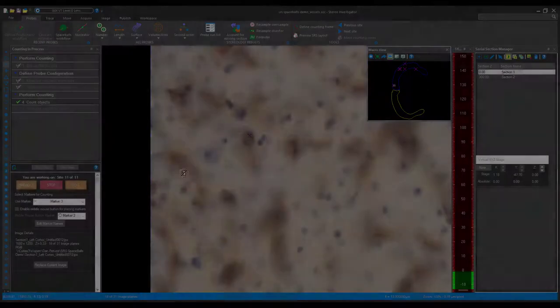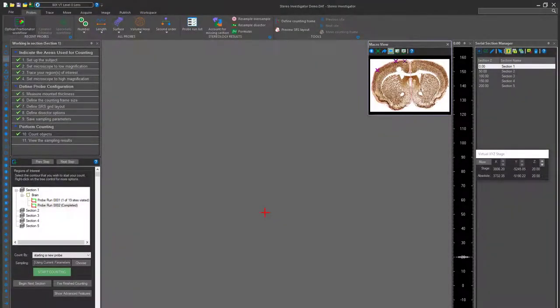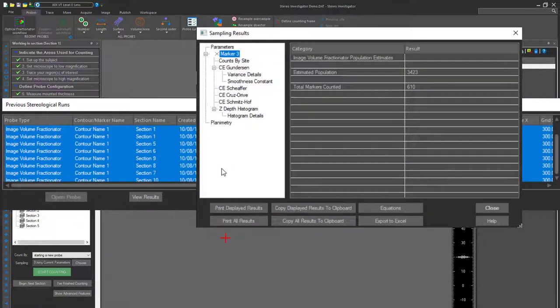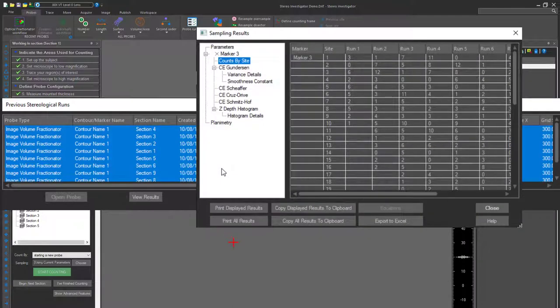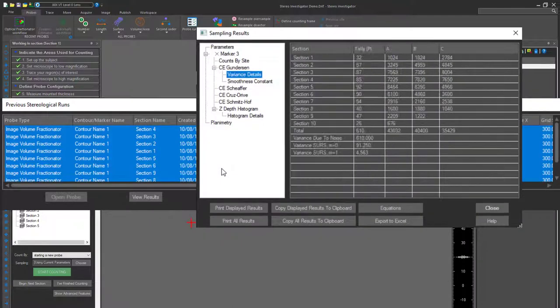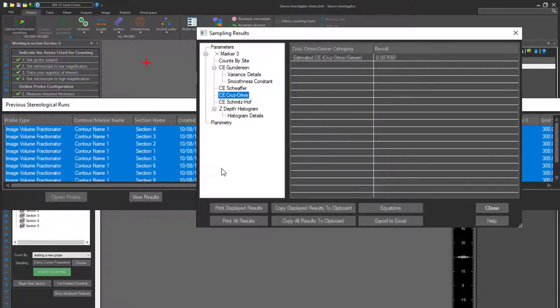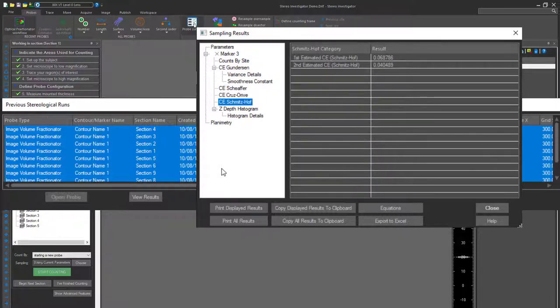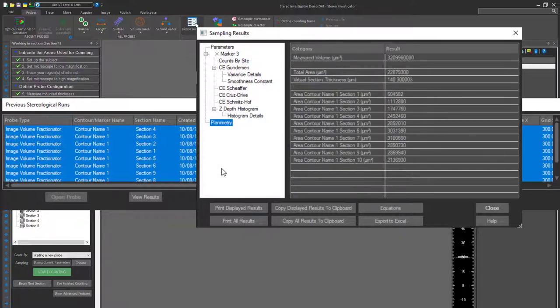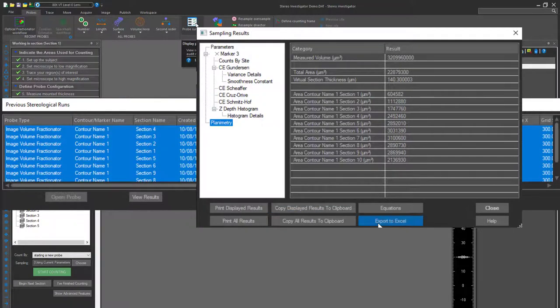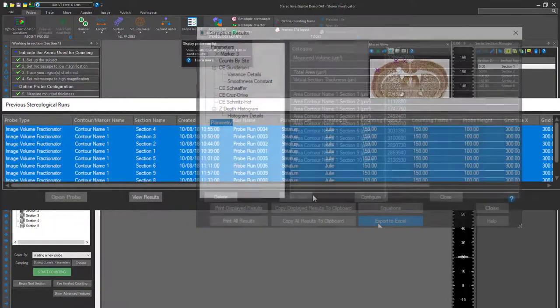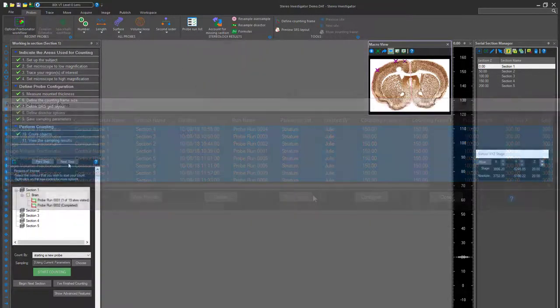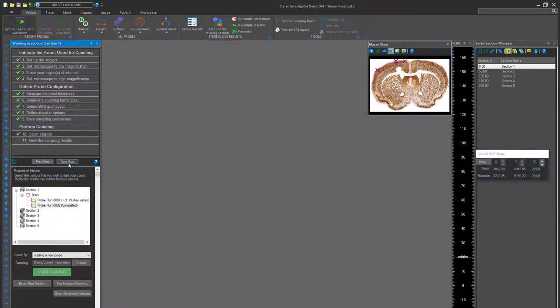After you are done with any of these probes, you can view the probe run list. Click Display Probe Run List, highlight all the probes for the contour type, and then view the results. You'll be able to see estimates of length of blood vessels, number of cells, size of cells, count by sites, variance details, histogram details, and much more.